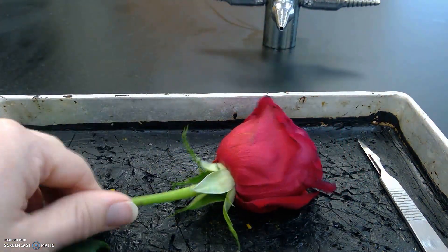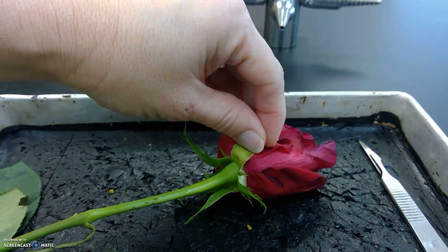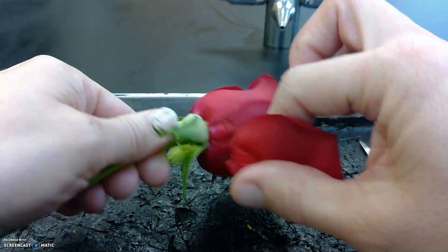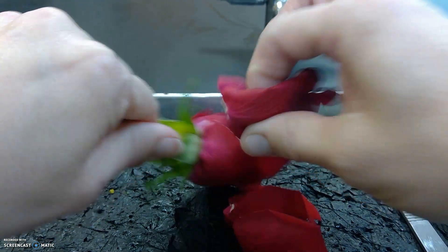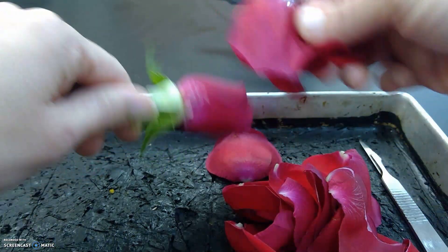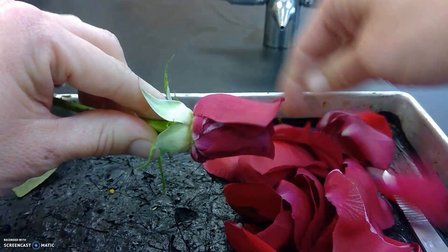It also has sepals, but these sepals kind of make sense — they're green and they protect the flower before it's blooming. We can see the petals would, again, attract pollinators. I'm going to go ahead and remove all of these so we can get into the middle. It's kind of a shame, it's a pretty flower, but anyway. Roses also have an odor, so again another thing that would attract pollinators.